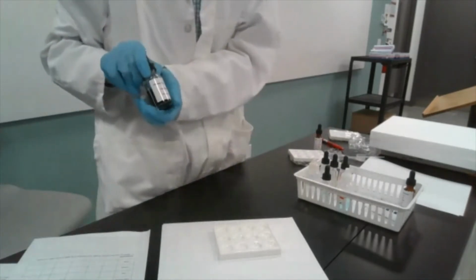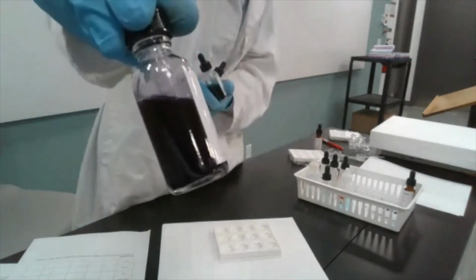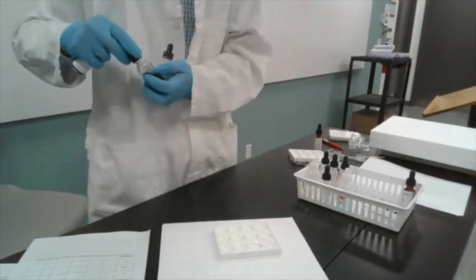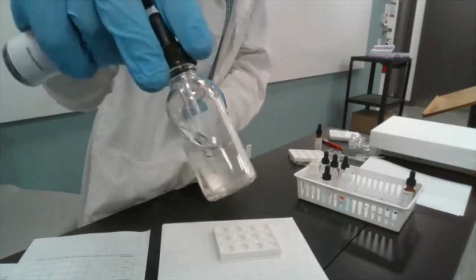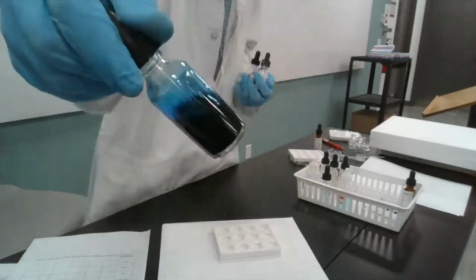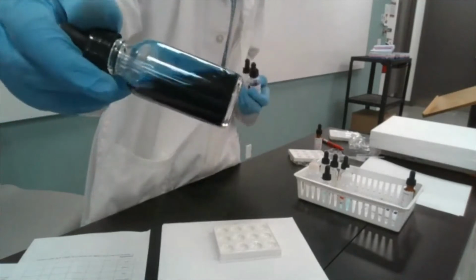So we have blue litmus. It's called blue litmus, but it's slightly purplish in its native state. Phenolphthalein is colorless when dissolved in a water alcohol mixture. Nothing remarkable about it until we mix it with something. And bromothymol blue, you see that it's a very nice clear blue.